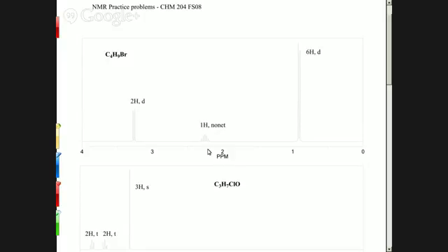So why did you come up with that? All right, this is a good example. You both have the right pieces, but they're connected in different ways, which means they're going to have different types of splitting. Wait, does this make sense? Yes. So you two are right, but can you explain why this doesn't?